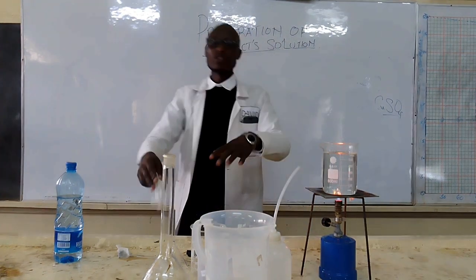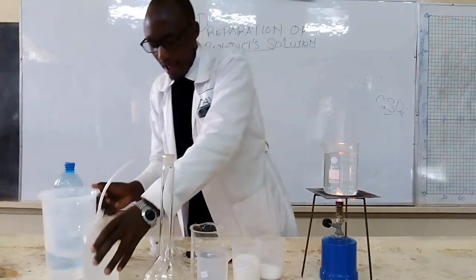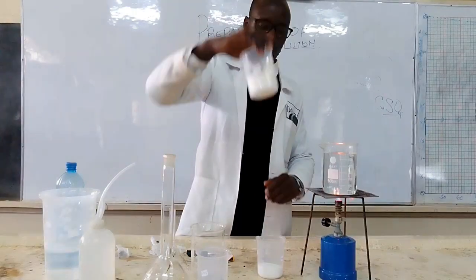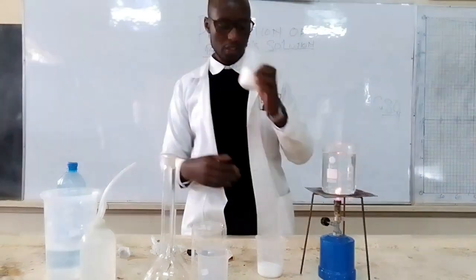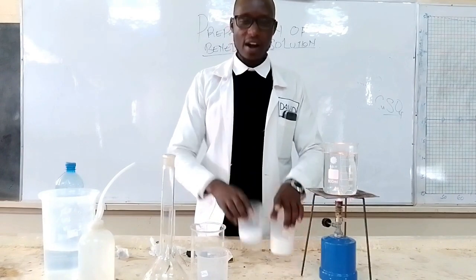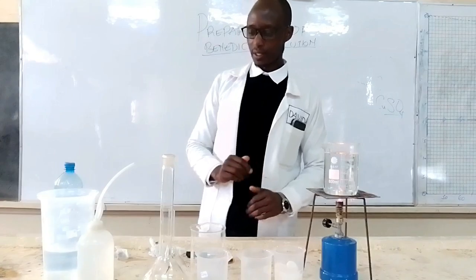So it is going to be more of a demonstration than writing. I'm going to start with 173 grams of trisodium citrate and 100 grams of sodium carbonate.